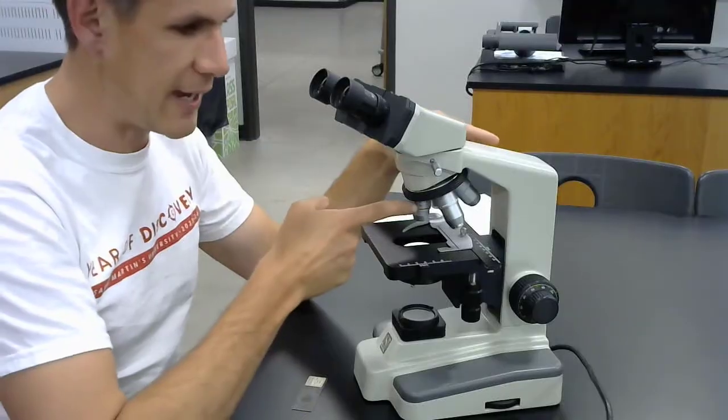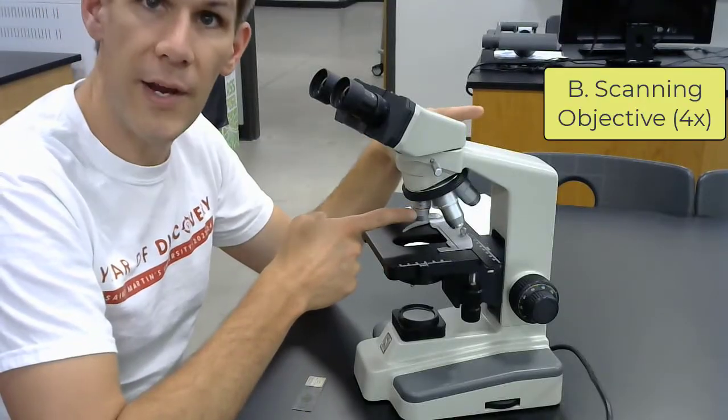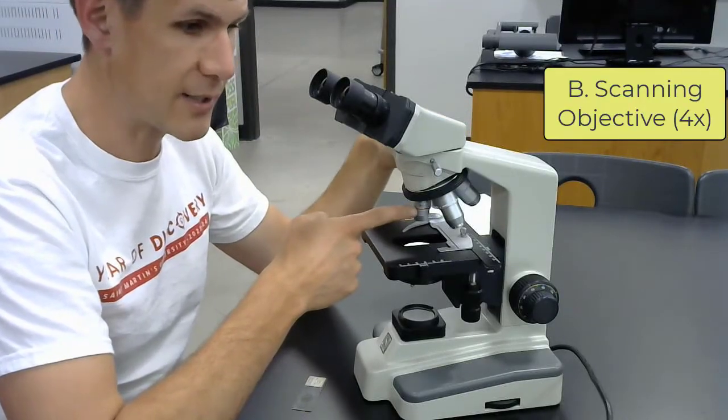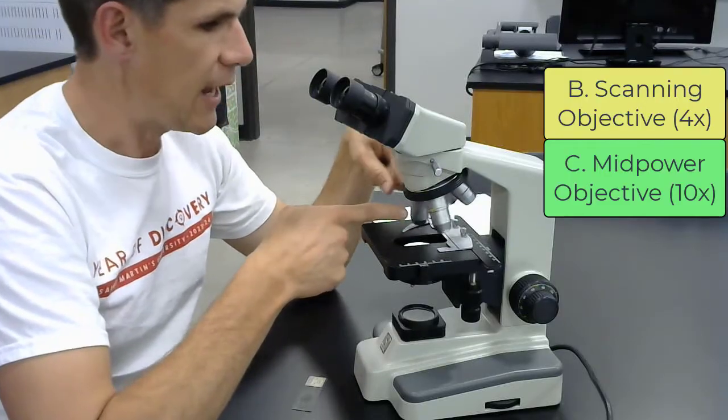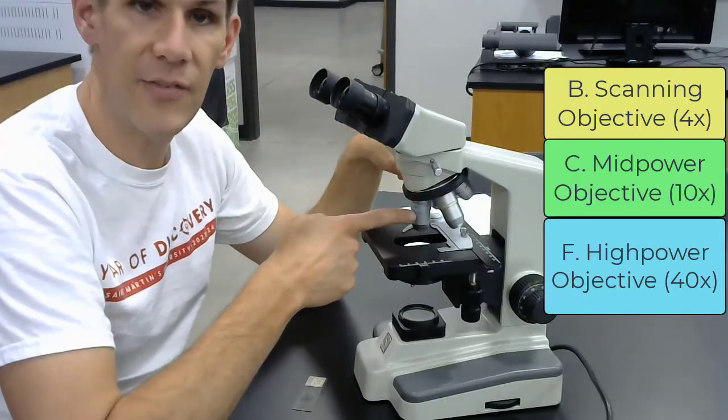Below that we have the scanning objective, which has a number 4 on it. It is the lowest power objective. The next one would be the mid-power objective, which has a number 10, and the high-power objective, which has the number 40.